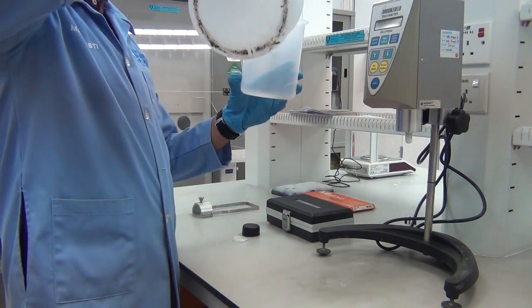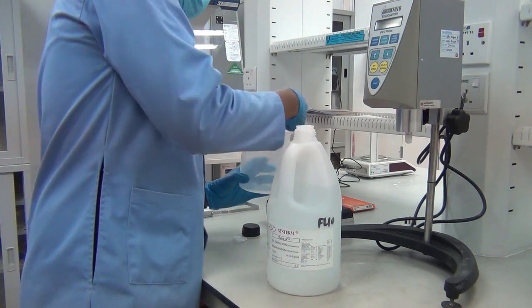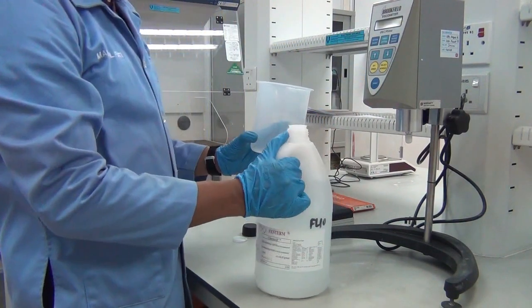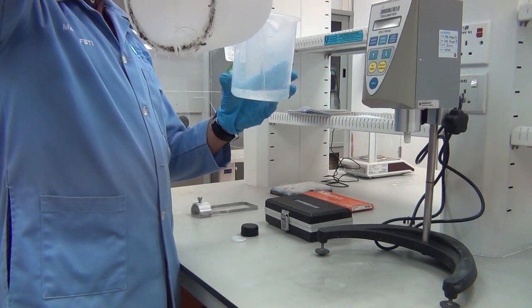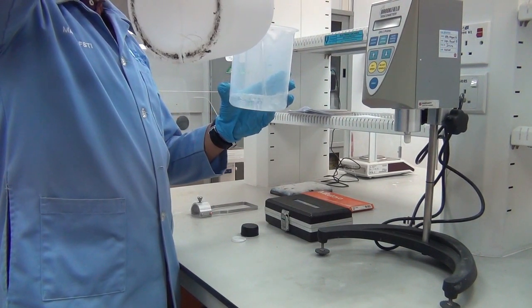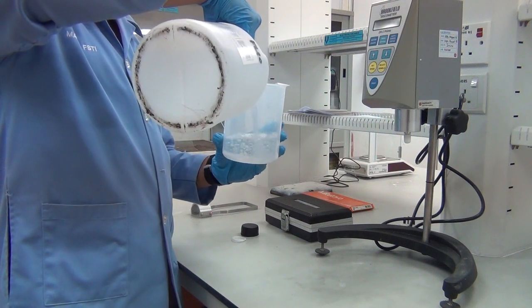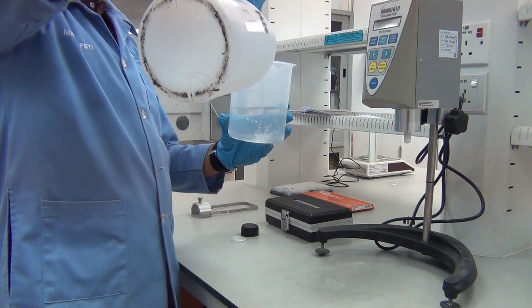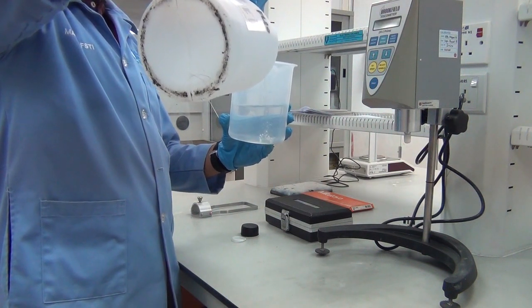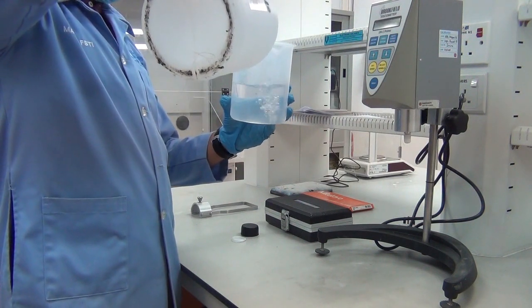Make sure you measure this fluid correctly and do not use less than 500 ml, because if it is less than 500 ml, the reading of the spindle from the viscometer cannot be measured. I mean, the viscosity cannot be measured correctly and some error will occur.